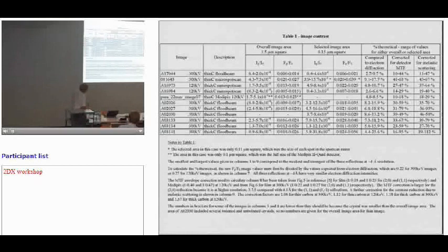And we calculate through all the amplitudes, compare them to the electron diffraction pattern, and correct them for the detector. You can see some of the ones at the beginning aren't so good. But the bottom ones, we've more or less got, not every spot, because there's a defocus and the beam tilt and so on, but we've more or less got it to be perfect. In other words, we've got an image now which, by analysis and understanding what's going on, we think is a more or less perfect image of a paraffin crystal.